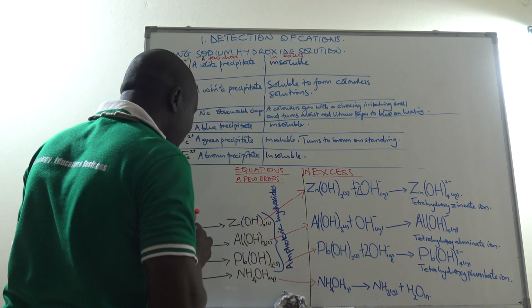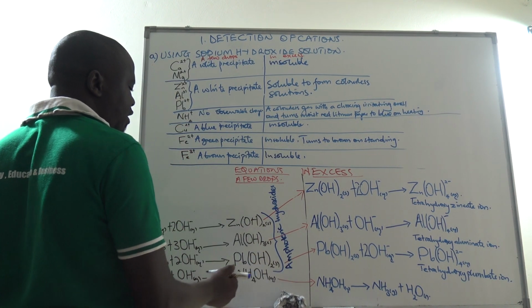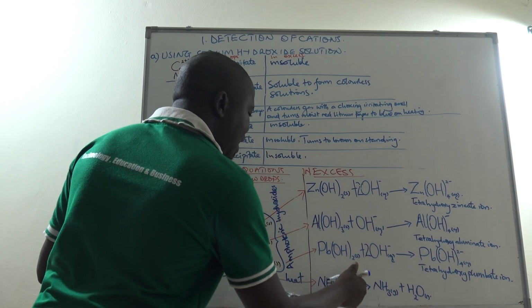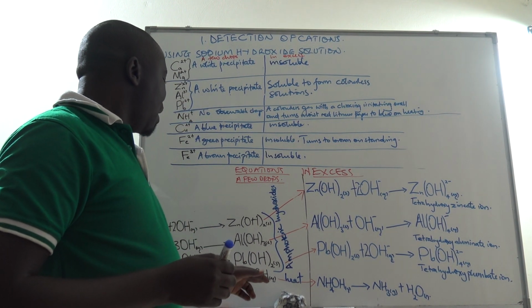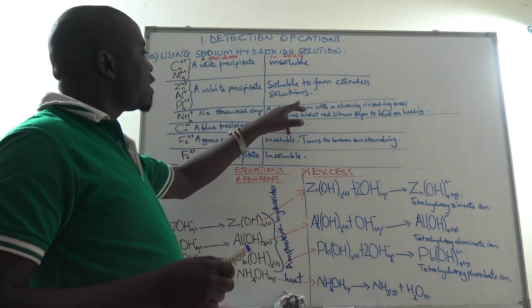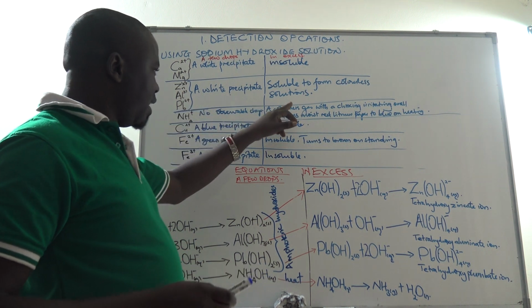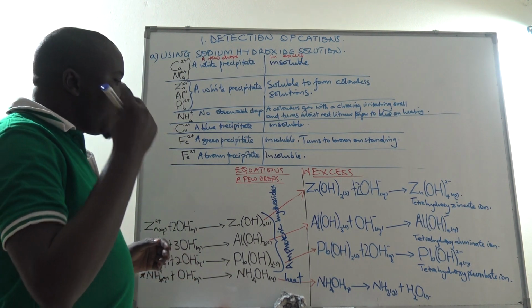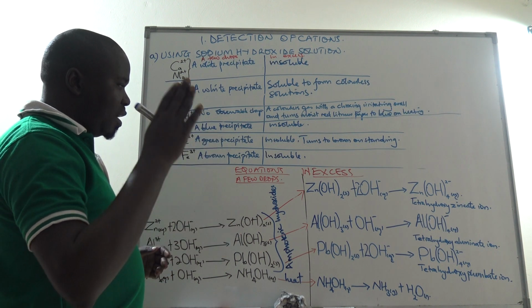Meanwhile, in this case the ammonium hydroxide, which is formed as a solution but not as a precipitate, when you go ahead and you heat, then you get this. So the heating decomposes the ammonium hydroxide into ammonia and water. That's why we said that when you heat, you need to test for ammonia. When you use sodium hydroxide solution and you get no observable change on heating, please, you need to be able to test for ammonia. And also your nose should be able to smell the gas. That choking, irritating smell, you should be able to get it.